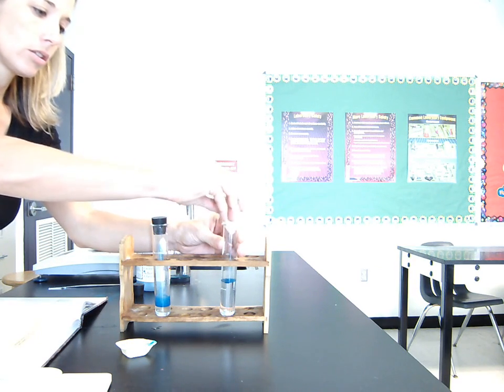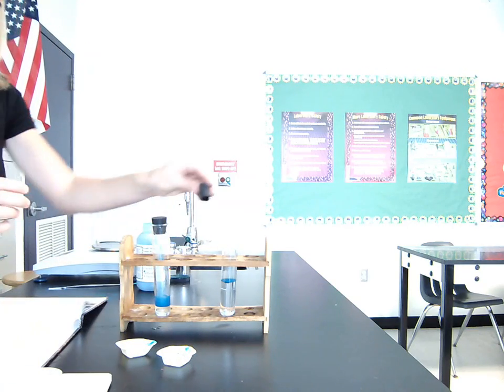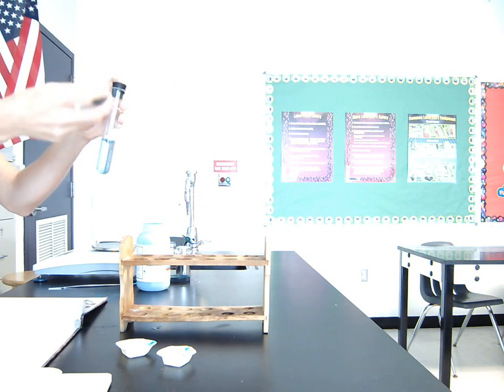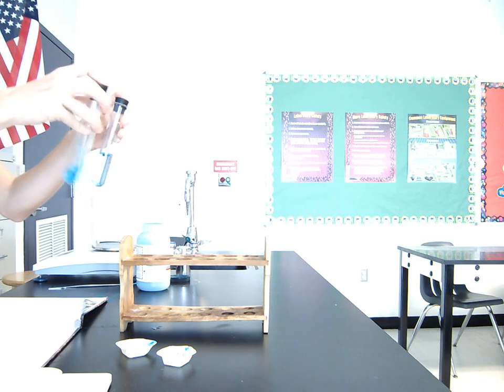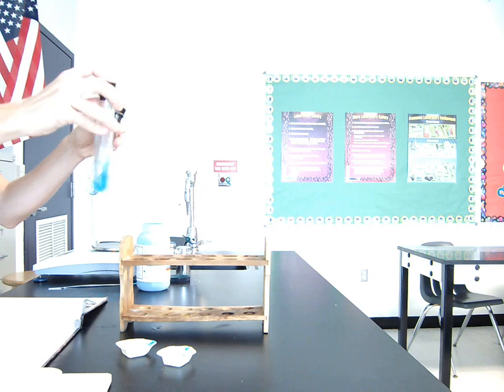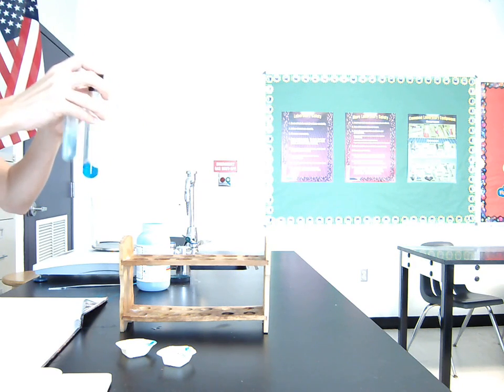And I'm also going to add the exact same amount of solid to 20 cubic centimeters of water. So both test tubes have the same mass of blue stuff. Now we're going to give it a minute or two to dissolve and see what happens. We'll compare them and answer a few questions about the solutions that we've created.